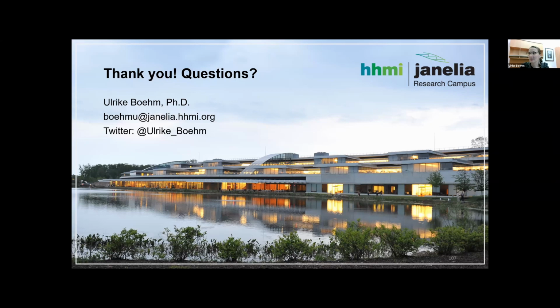Yeah, I think you're right. There's media out there where you would have the ability to keep the pH quite stable, but from the experience I had when I was working at the interferometric PALM, I always got the best results when I prepared this very fresh. I don't know exactly what all the underlying conditions are, but we tried to have mixtures which were very stable over time.